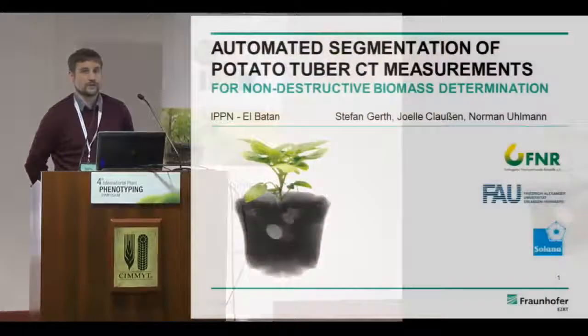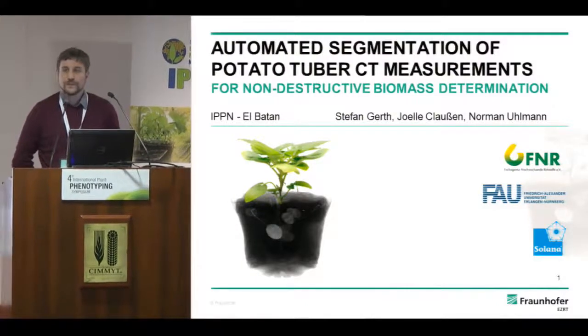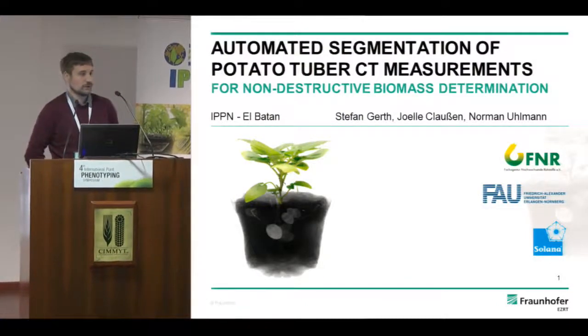Okay, so thank you very much for the opportunity to talk here. In the last talk there was also a bit about X-ray computed tomography, and I would like to show how this can also be completely automated, applied for biomass determination of potato tubers in soil.